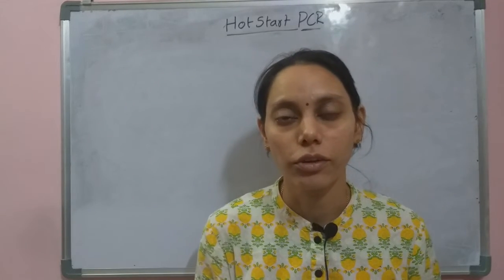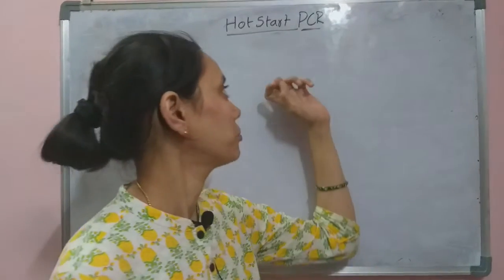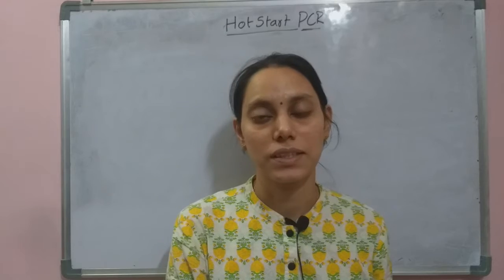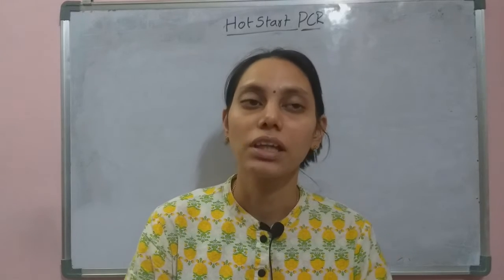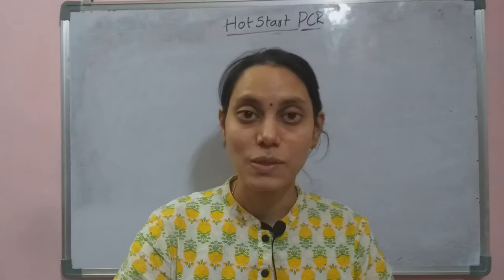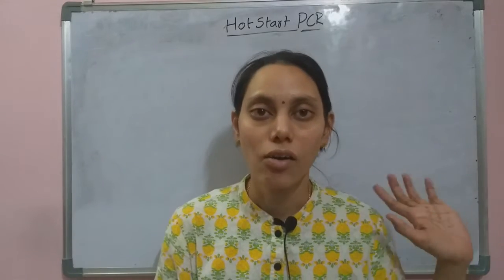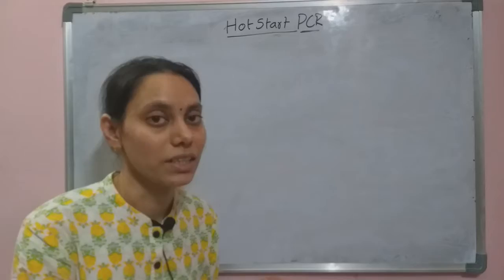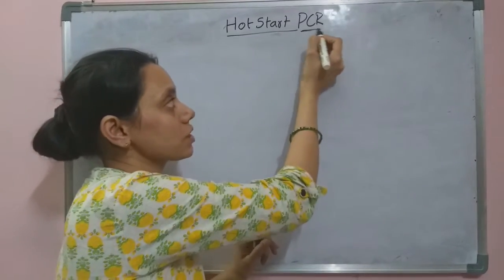In this video, we are going to discuss hot start PCR. We are going to get the basic idea of what exactly hot start PCR is, why it is important, and what the principle and process involved in this hot start PCR are. So basically, as the name indicates, it is a type of PCR.